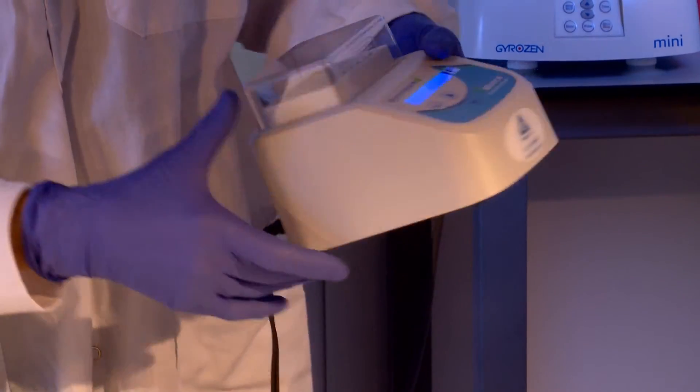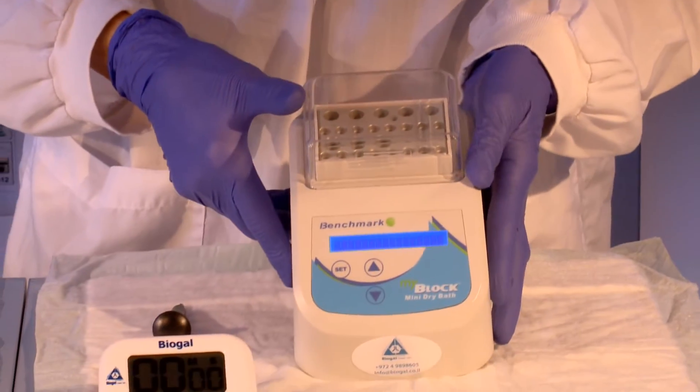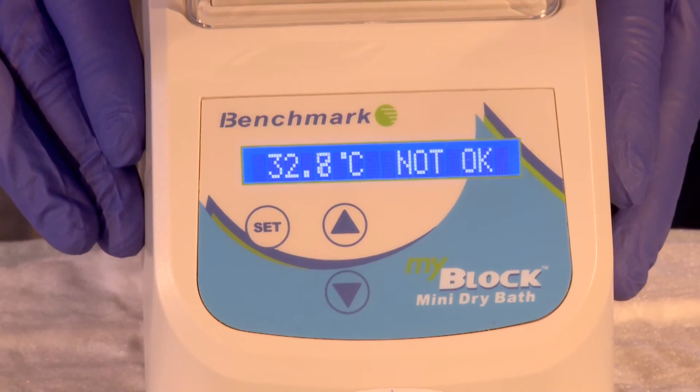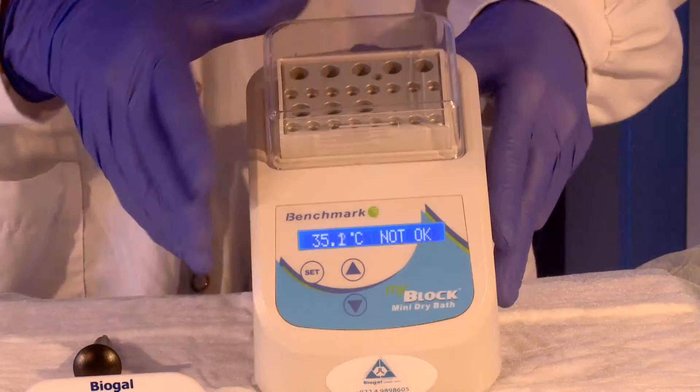Turn on the heat block and adjust the temperature to 95 degrees centigrade. When the target temperature has been reached, you can begin the DNA extraction process.